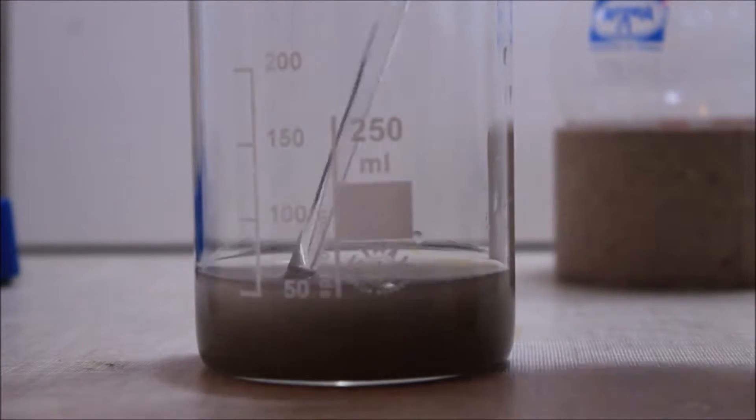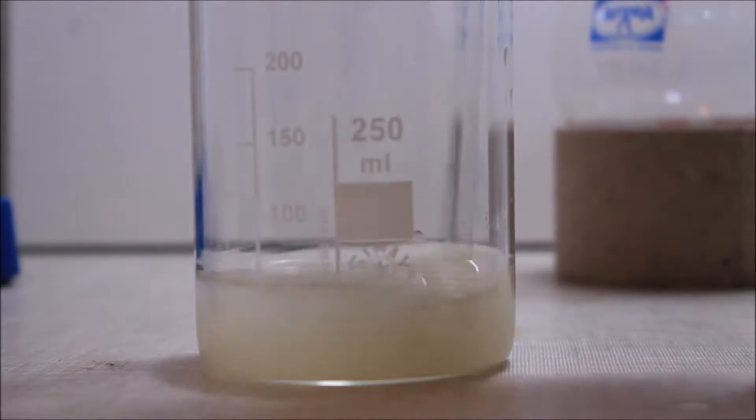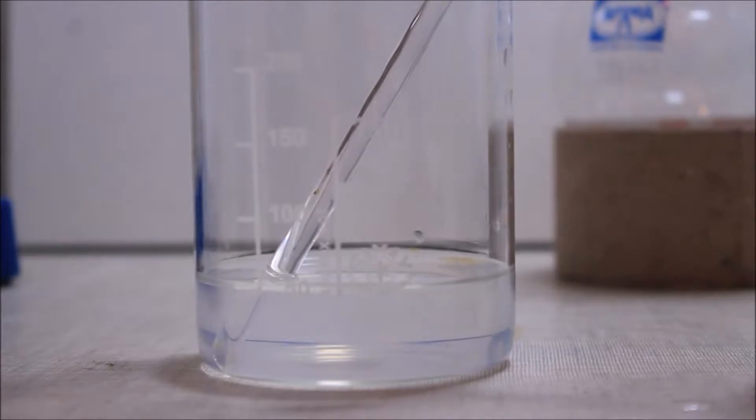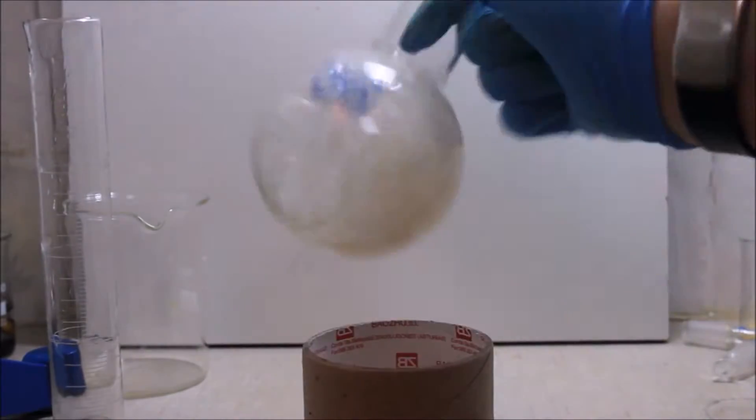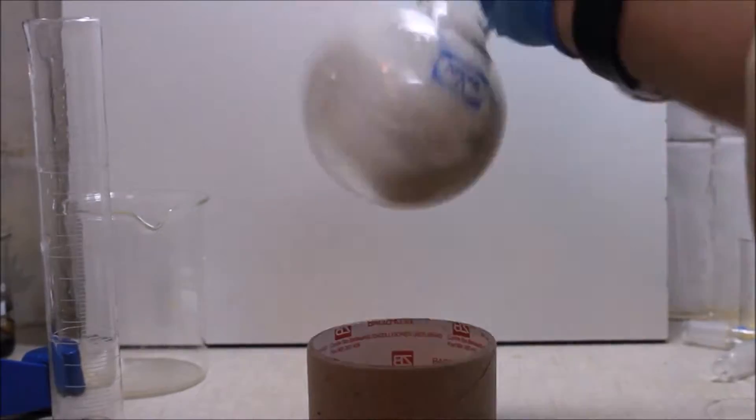This complex is able to react with the aldehyde in a redox reaction. The aldehyde is oxidized to the carboxylic acid while the silver complex is reduced to metallic silver. Due to the formation of the metallic silver, the reaction can be used to create a silver mirror by the deposition of silver particles on a clean surface.